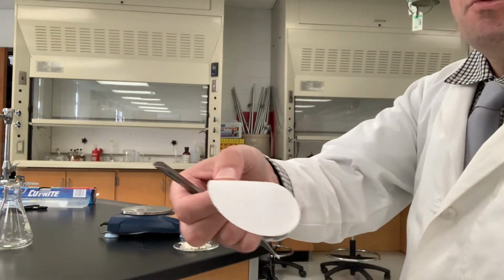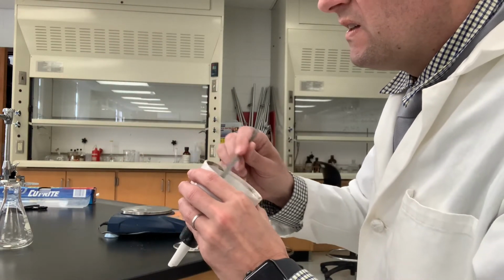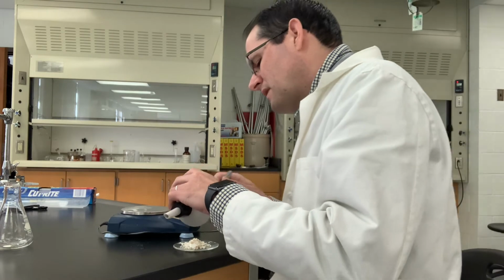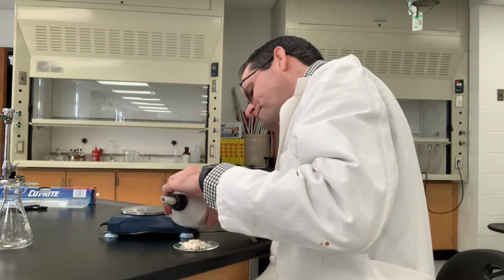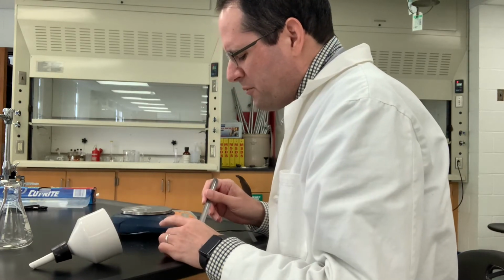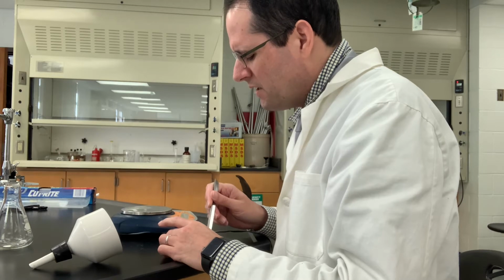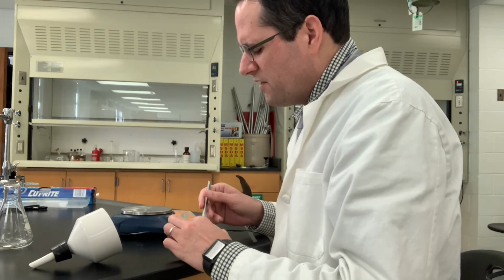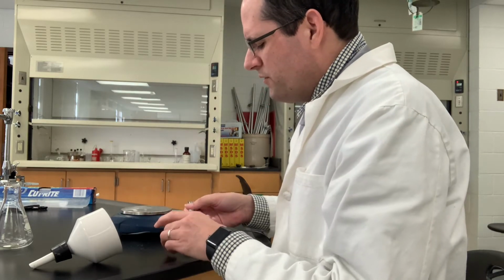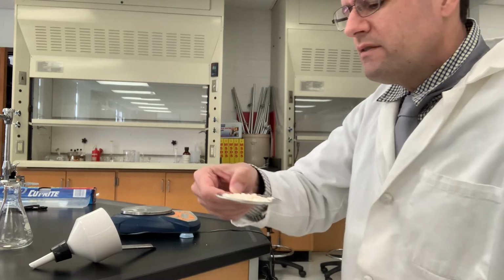So that's a pretty clean filter paper there, and once again, just need to get around the perimeter here. There's always a little bit of solid that builds up around the edges. So I won't remember this, so I'm going to just take the camera around and measure the mass here that we have, and then I'll check it again on Thursday, and should be good. Okay. One other reason for transferring it to the watch glass is to increase the surface area, and that will allow the water to evaporate a little bit better.